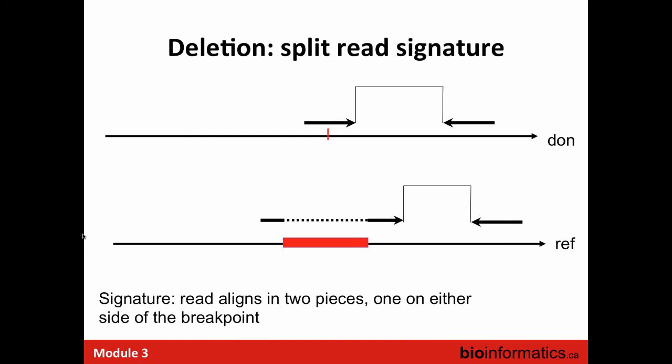Right, so another line of evidence for structural variation is split reads. This is where BWA has just introduced a large gap into the read, as I was just explaining. Here's an example where there is a deletion, and the aligner might just split that, introducing this gap corresponding to the deletion. Usually when this happens, these are easier events to find than when you're just trying to infer it off of the fragment size distribution.